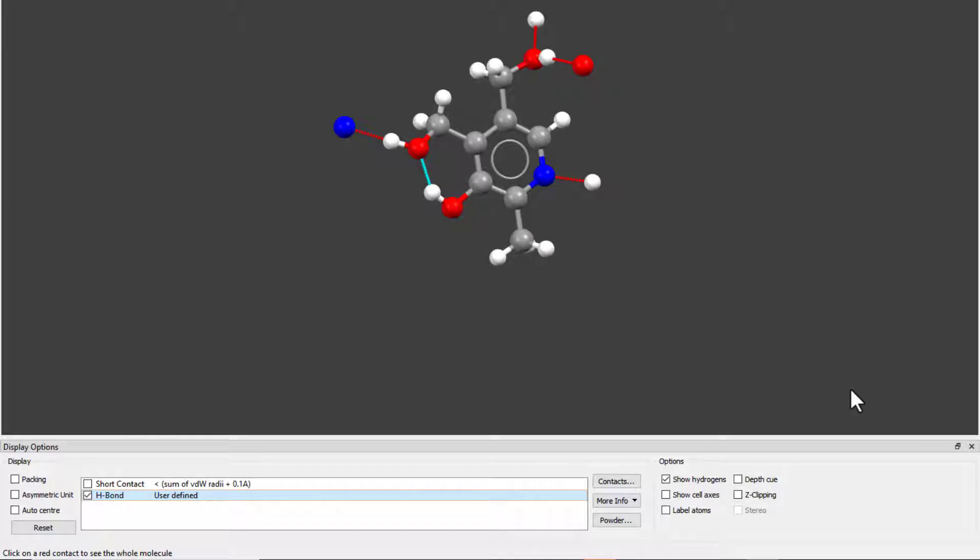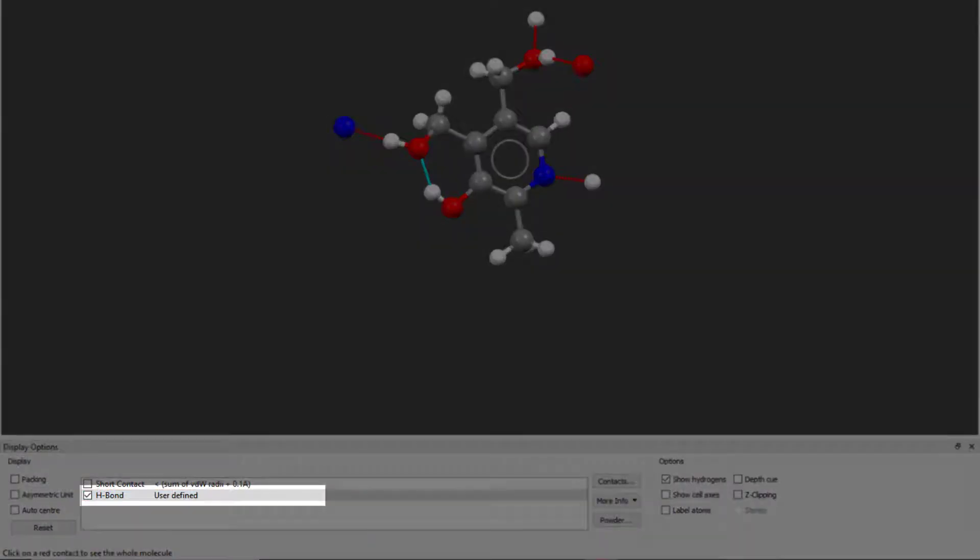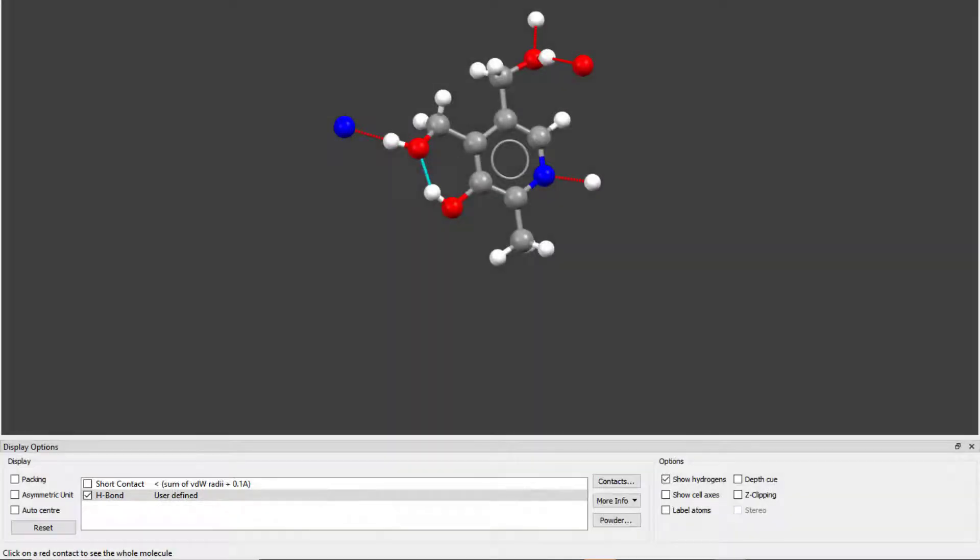To visualize hydrogen bonds in the structure, we simply tick the box next to H bond. As we have just edited the definition, hydrogen bonds are already on for us.